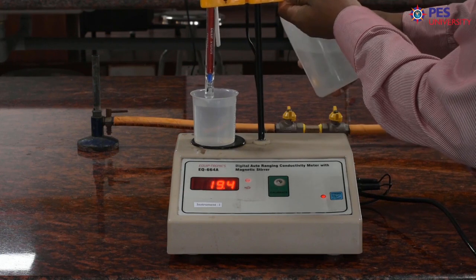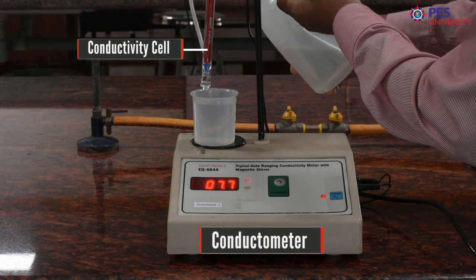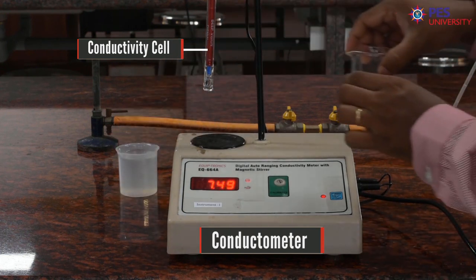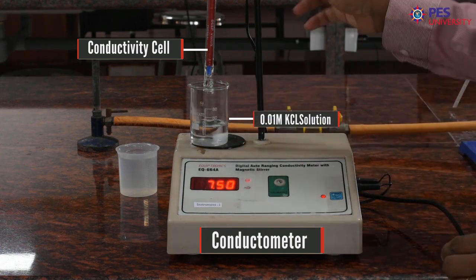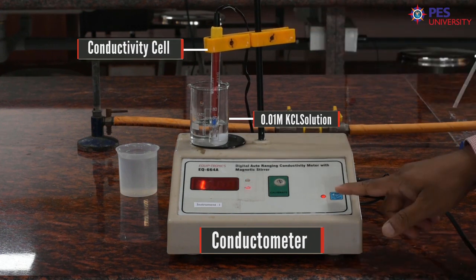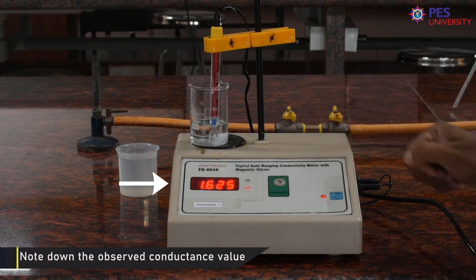After that, rinse the conductivity cell with distilled water. Then immerse the conductivity cell inside 0.01 molar KCl solution. Magnetic stirrer is on. Now note down the observed conductance.